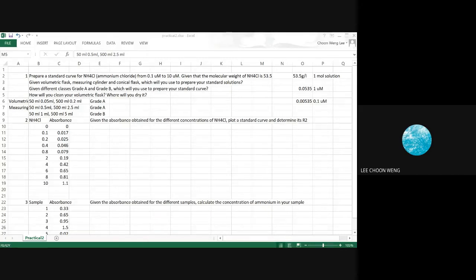Anyone? No. Yes, Afik is correct. This is very, very small. How are you going to measure this? All the weighing balances in the lab, once you reach about 3 decimal places, are already not stable. So how do you measure it?